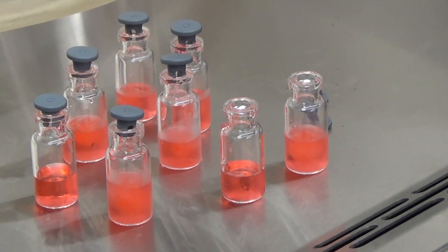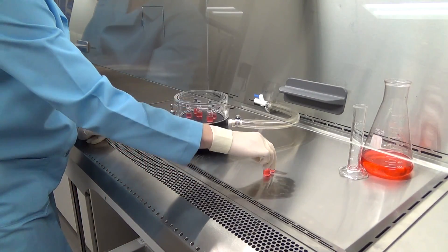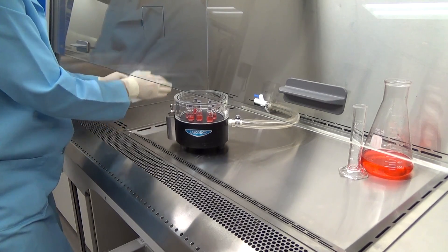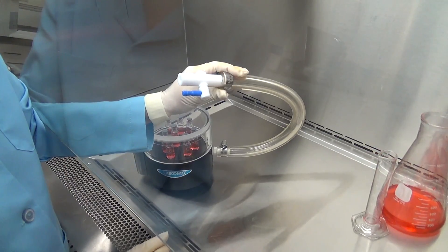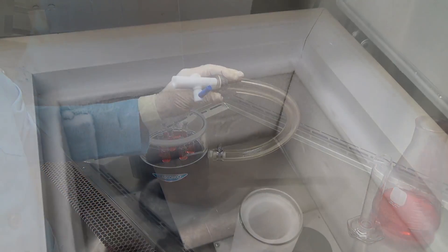The aseptic adapter can be used along with the mini stoppering chamber to stopper small samples under aseptic conditions. In a sterile workspace, load your samples into the mini stoppering chamber with stoppers loosely sitting on each vial. Place the lid on the chamber, insert the aseptic adapter into the hose of the mini stoppering chamber, and make sure it's in the closed position.